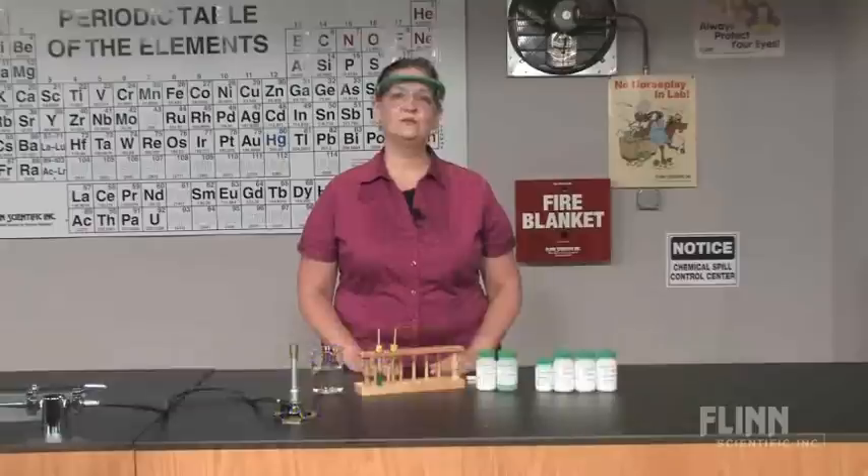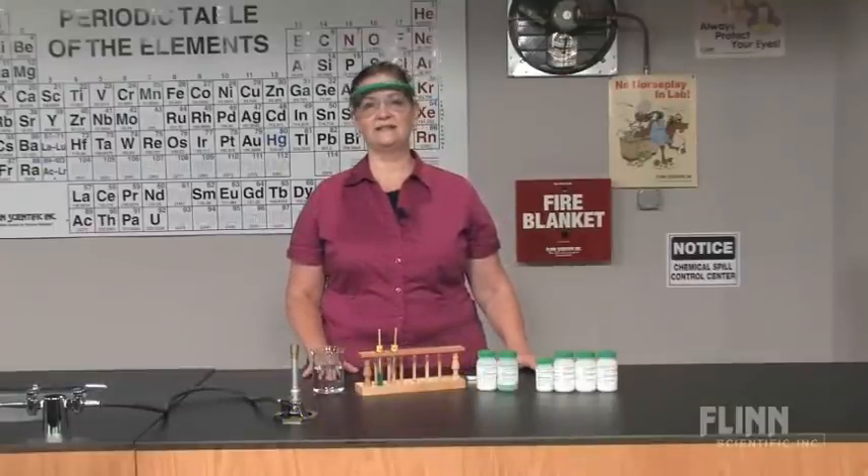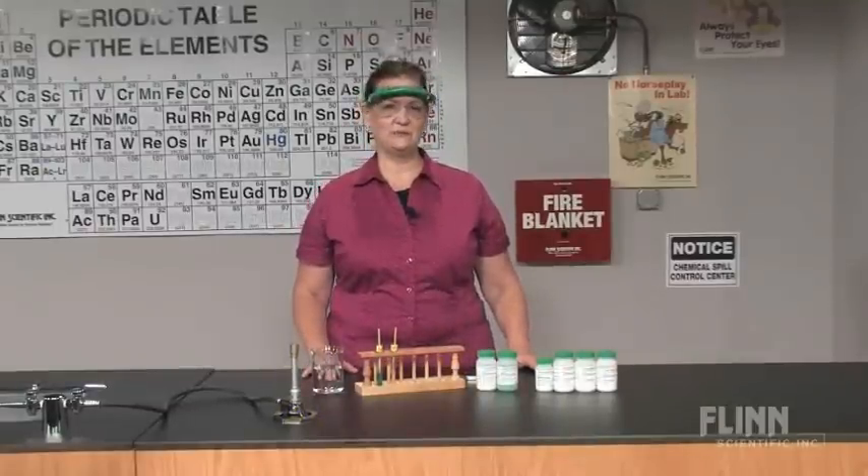Flame tests are often conducted in the laboratory and may be done in a variety of ways. We have found that using wood splints is a safe and simple way to do a flame test, especially if you want student participation.